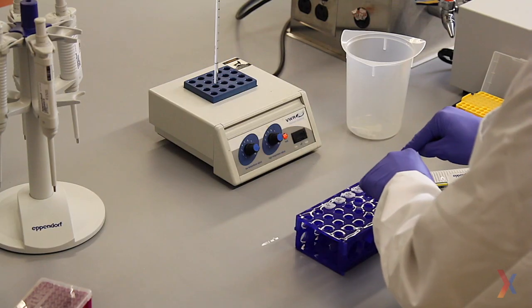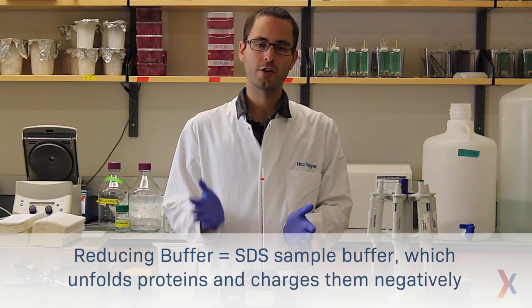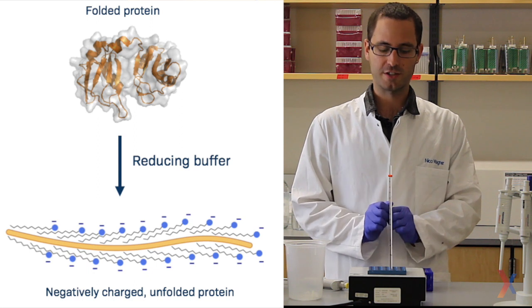The first step of preparing for a protein gel is to take the samples and add reducing buffer to them. The reducing buffer unfolds the proteins and coats them with a negative charge, which allows them to travel through the gel.